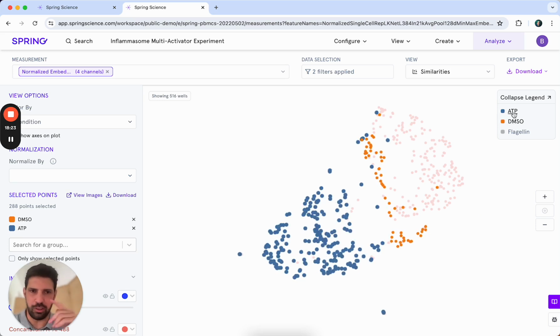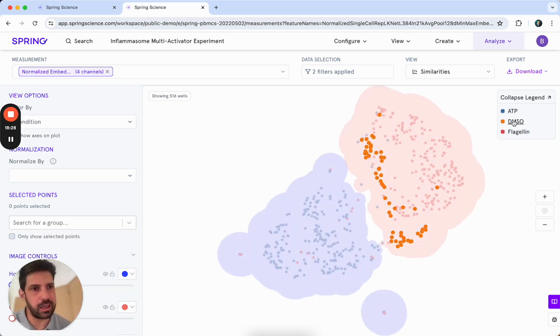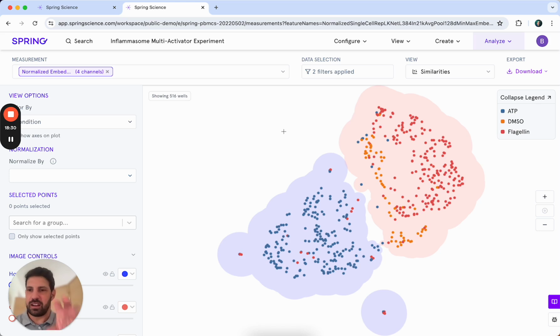And in this case, it also helped us understand mechanistic action because we had different activators in the experiment and the like. This interface is very powerful if you want to just separate populations for any reason. It could be separating them based on different experimental states, like these inflammasome activation states. It could be wanting to understand healthy versus diseased phenotypes. Are those different, and how are they different? It could be wanting to separate responders and non-responders.